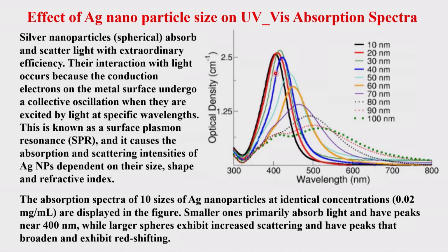What you see is that the peak position is changing, the peak width is changing, the peak is becoming very broad, and the peak is becoming very asymmetric. There are so many parameters. The peak position is shifting, the sharp peaks became broadened, and the spectra became skewed. Here you see 100, there is one where it's almost split into two parts. There is one band here, and there is another band here.